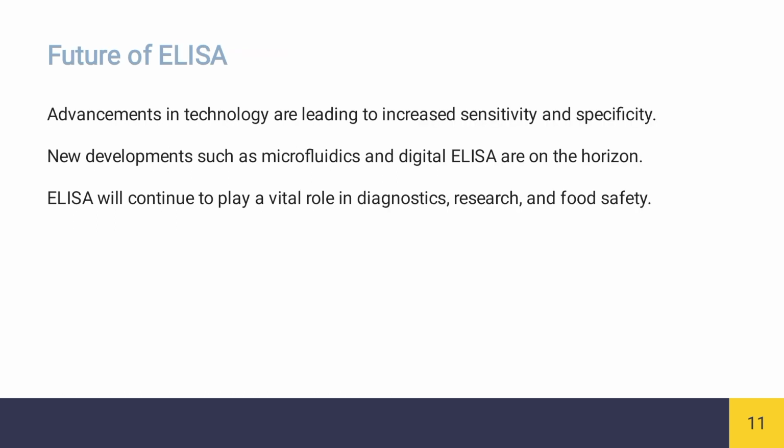Future of ELISA. Advancements in the technology are leading to increased sensitivity and specificity. New developments such as microfluidics and digital ELISA are on the horizon. ELISA will continue to play a vital role in diagnostics, research, and food safety.